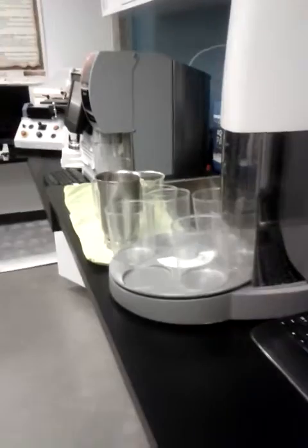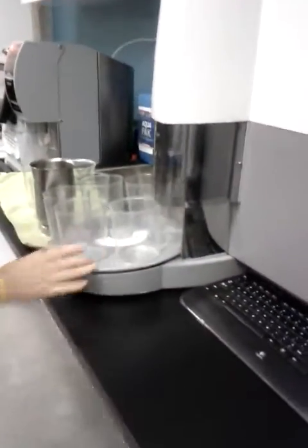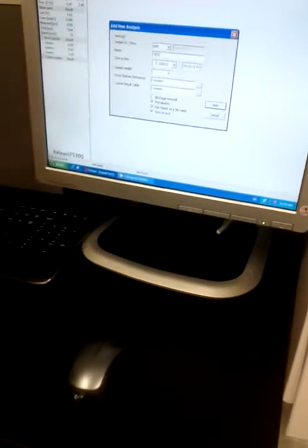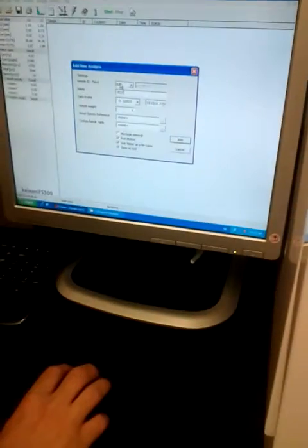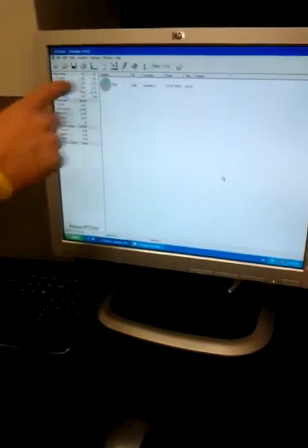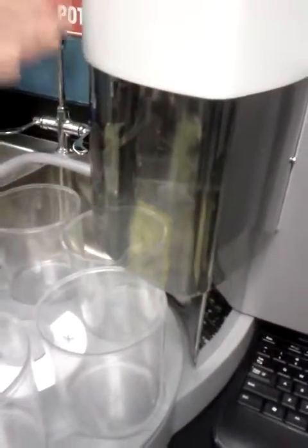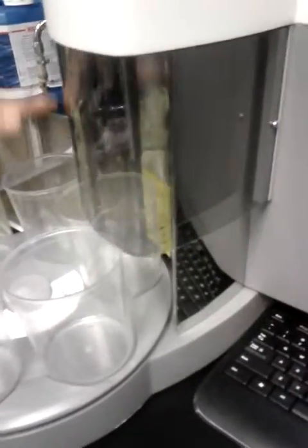What I do, I look against the light just to see approximately how many fibers there are, because with the eye we cannot count. Okay. Don't let it be too concentrated. So once you enter, for example, test 8, your deposit files, just add. For example, your first is always this one, and the second, the third, the fourth, the fifth, and the sixth.